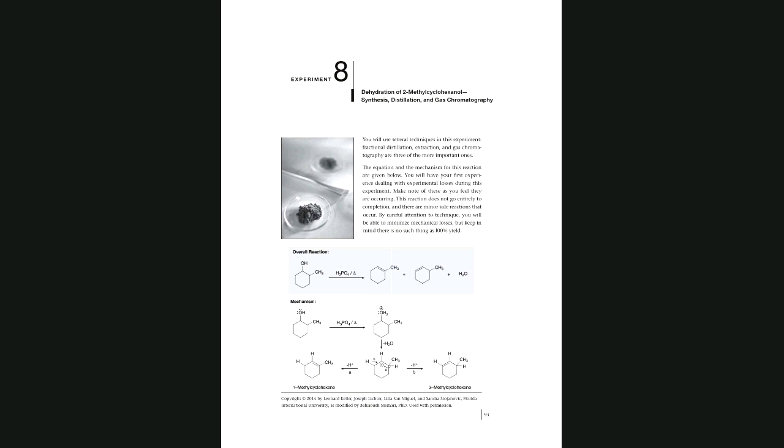Sometimes the melting point of the product is the melting point of the reactant. Based on the chemical reaction, you already know what your reactant should be and what your product should be. So if you already have a name for the product, you have physical properties for that product. Where do you find them?